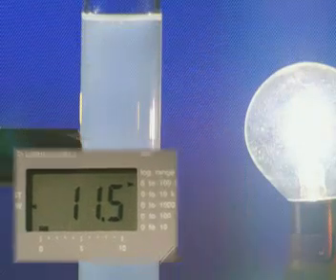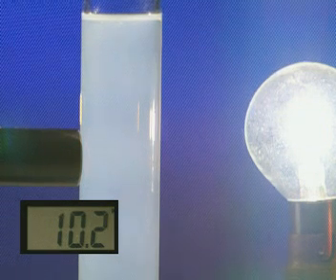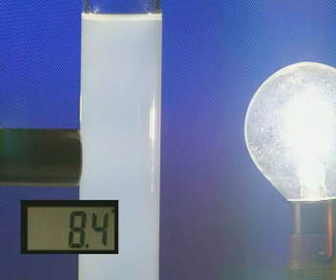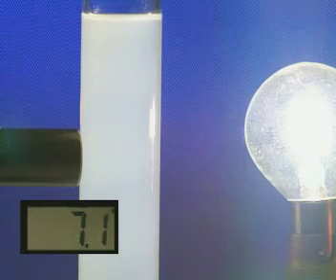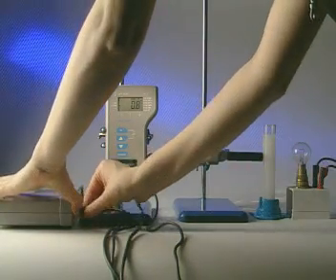The meter reading continues to fall. The reaction is over when the amount of light reaching the meter remains steady. A data logger captures all this information.